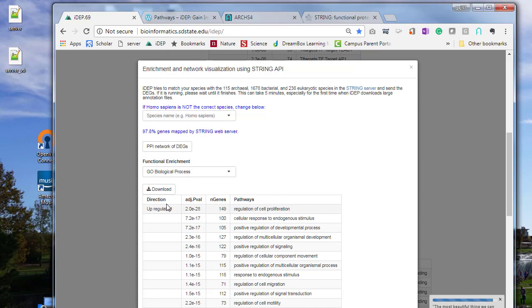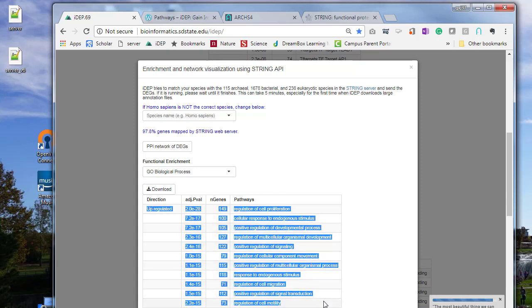These results are entirely computed, the calculation and also the annotation database, on the string database. As you notice, I also clicked here to get the next steps started.